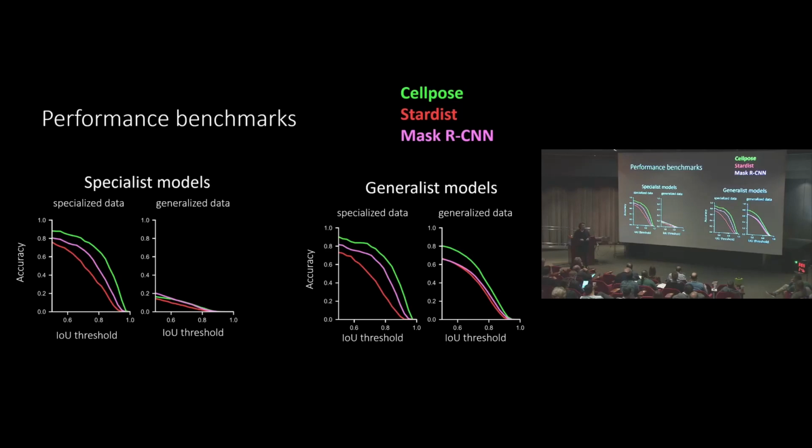No, that's not the case. We're still at maximum capacity here. Whereas now on generalized data, we're starting to do pretty well. And you can see here, again, we are outperforming these other models, but more importantly, compare this to this plot over here. So on generalized data we can now give you fairly good segmentations.